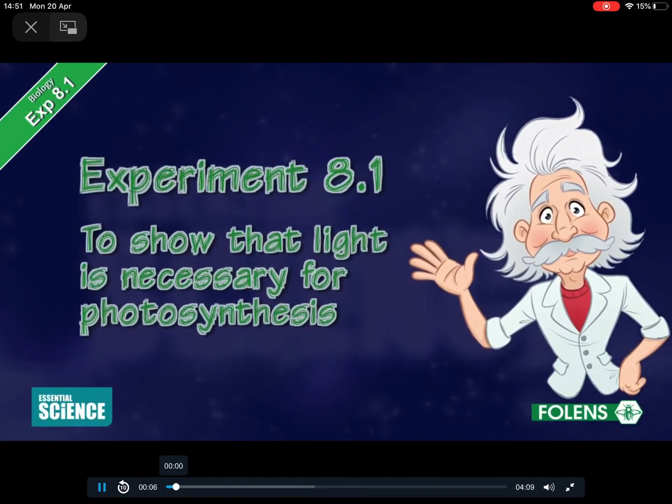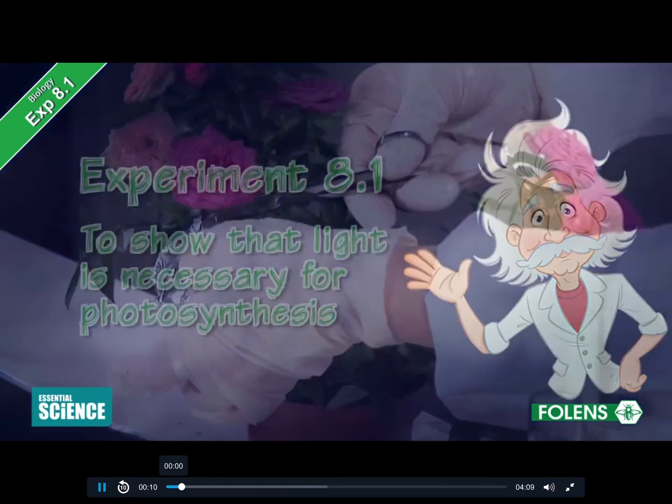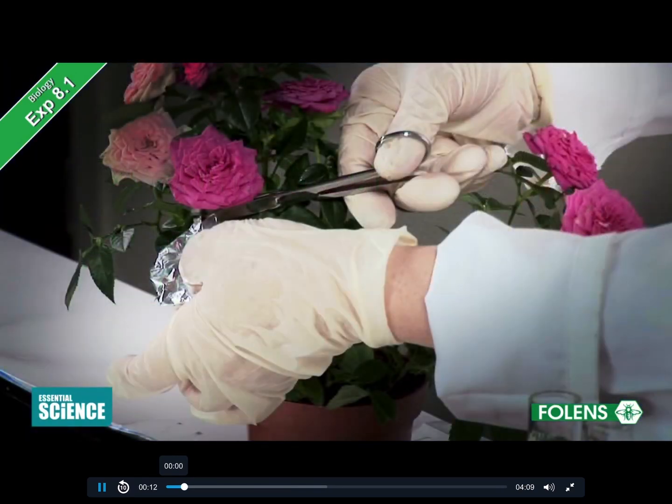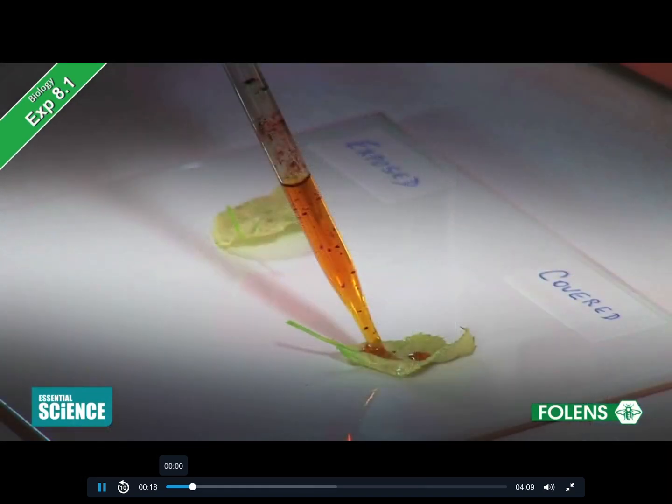Experiment to show that light is necessary for photosynthesis. In this experiment, we will show that a plant produces starch during the process of photosynthesis, but only if light is present.